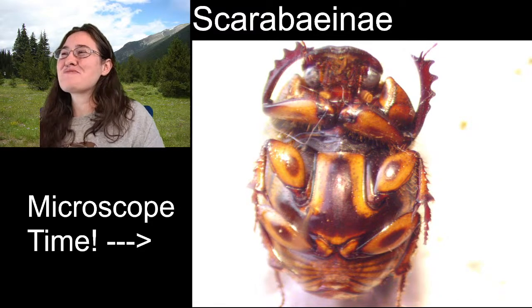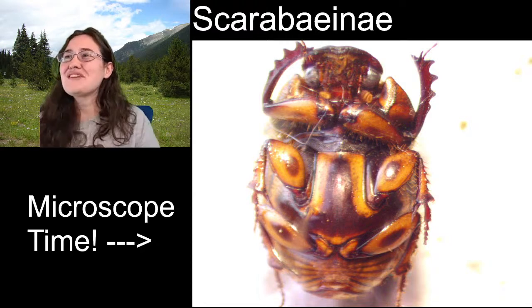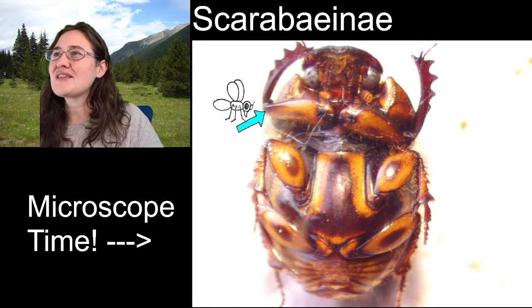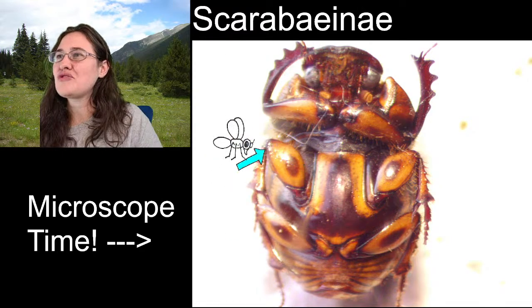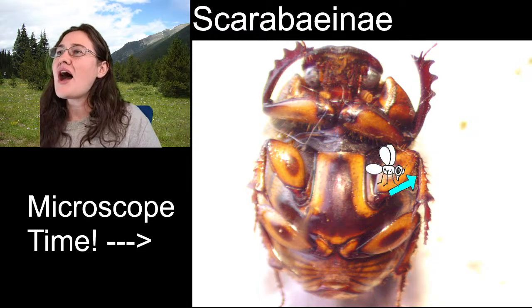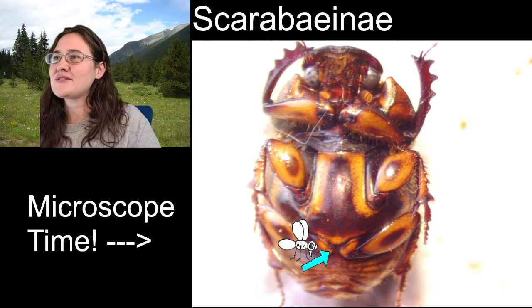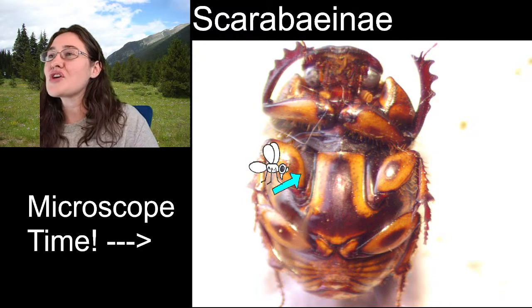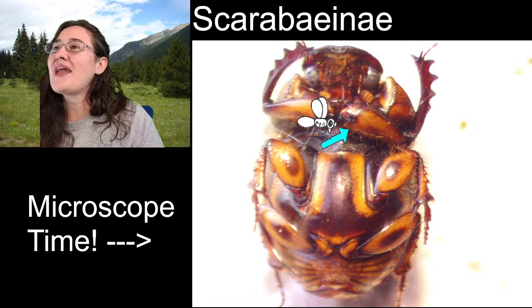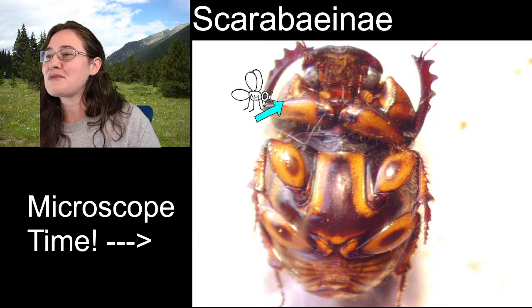Look at how beautiful this dung beetle is. I absolutely love the colorations on the femurs under here. So you can see, what we saw were the tibia, but you couldn't see these really strong looking epic femurs down here. This little triangle that this femur is connected to, and then this little odd shaped pizza shape, those are the coxal segments or the coxae of this beetle. And we have to look at the bottom side of the face because there are all types of really awesome and cute mouth parts down here.